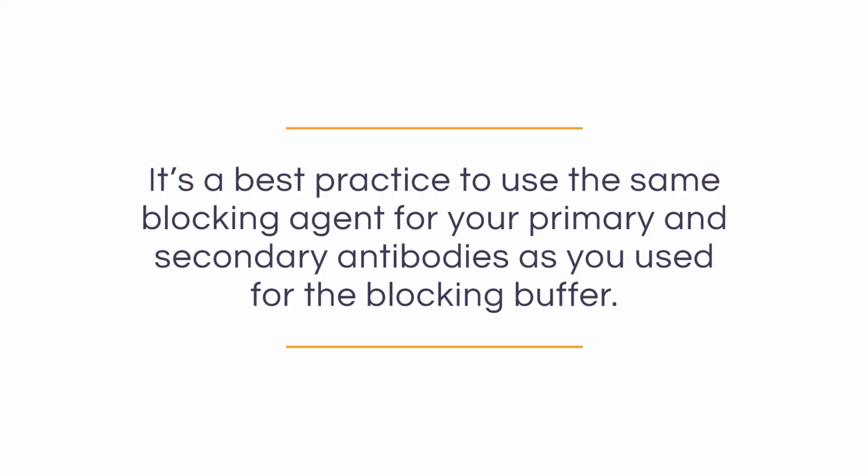So even though the primary antibody does contain a blocking agent, the new agent will not be able to replace all of the original blocking agent that was displaced from the membrane. So this is why it's a best practice you should use the same blocking agent for your primary and secondary antibodies as you used for the blocking buffer. Just make sure you include some detergent.